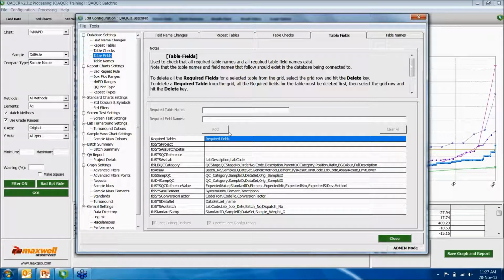So this has been disabled, and from now onwards you won't be able to make changes in this window. But yeah, the basics, it's good enough as it is, so no need to make any changes at this stage.